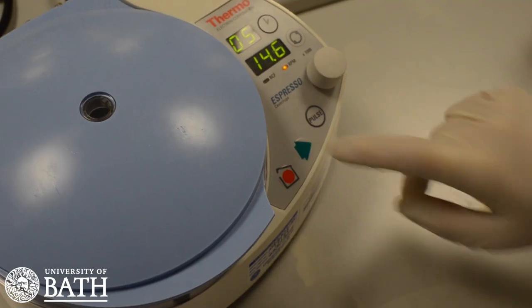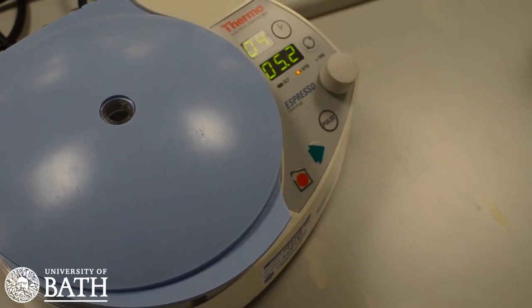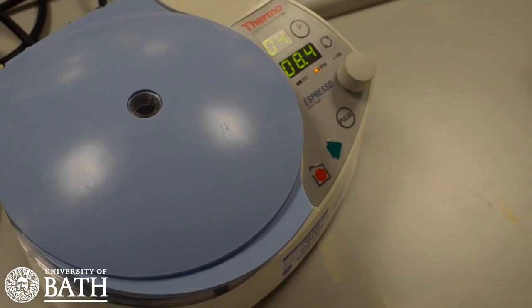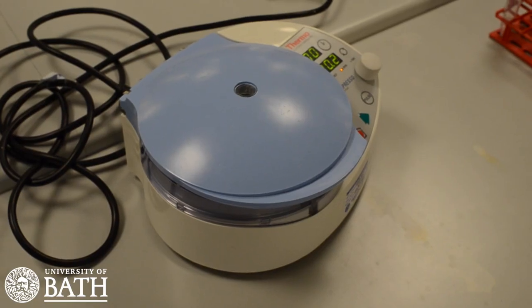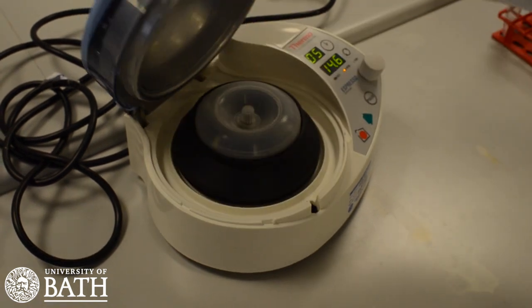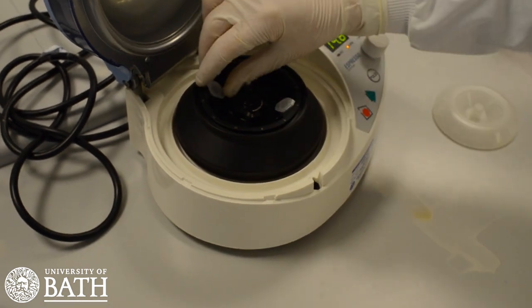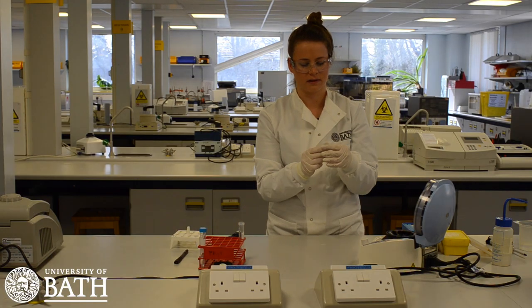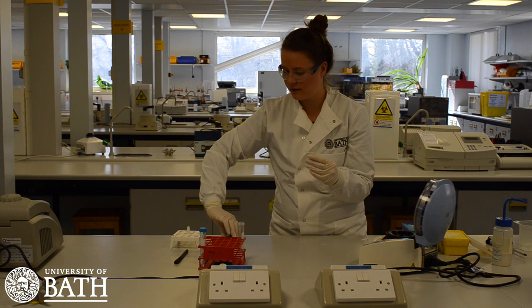Close the lid and set the sample to spin for 5 minutes at full speed. When the centrifuge has finished running, the lid will pop up, enabling you to remove your microcentrifuge tube. Make sure to take the microcentrifuge tube that contains your own DNA. When you remove your microcentrifuge tube, you should see a match head sized milky white pellet at the bottom of your sample tube. These are your cells.